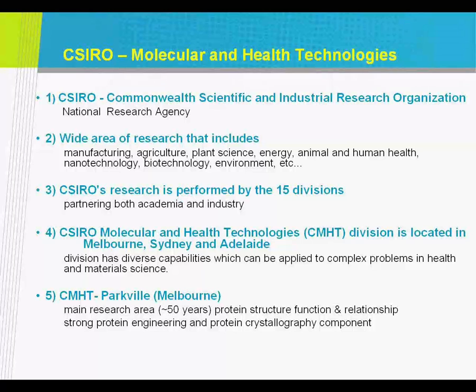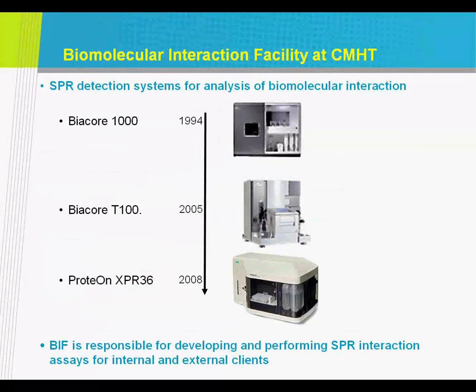We are responsible for developing and performing SPR interaction assays for internal and external clients. So we support internal projects, but we also do fee-for-service contracts for external parties, and we also serve bigger projects that may require our facility.